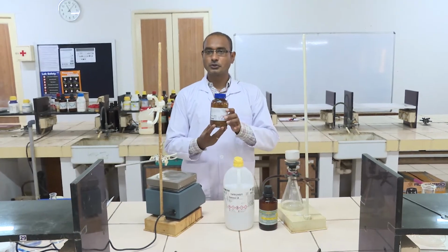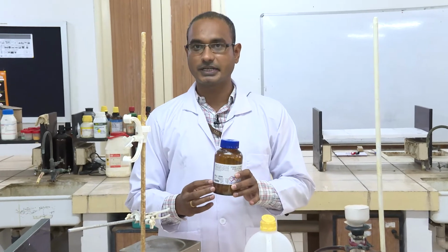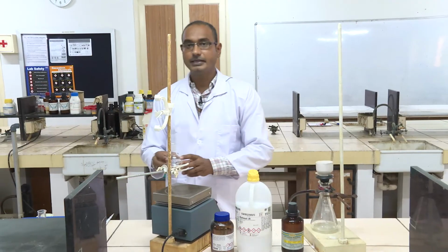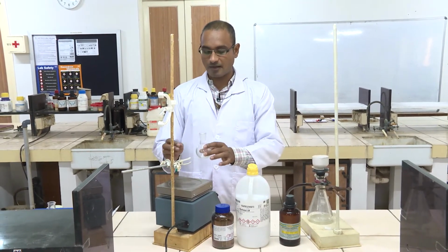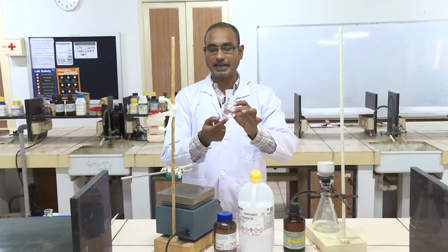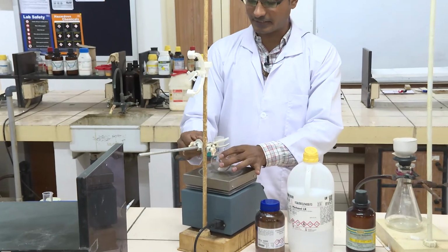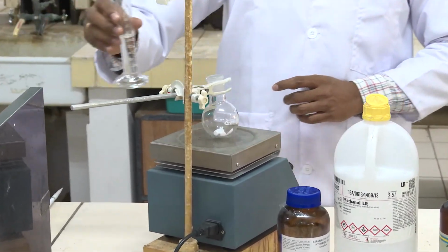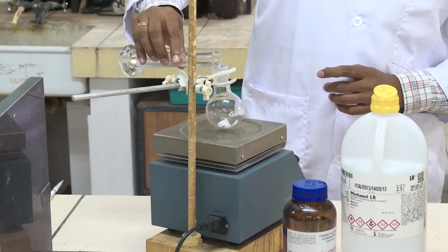Now I am going to show the reagents required for the synthesis of tin oxide nanoparticles: tin tetrachloride, methanol and aqueous ammonia. I weighed 1 gram of tin tetrachloride in a 100 ml round bottom flask, which also contains a magnetic bead. Now I am keeping it on the magnetic stirrer. Now I am going to add 30 ml methanol to dissolve this tin tetrachloride.